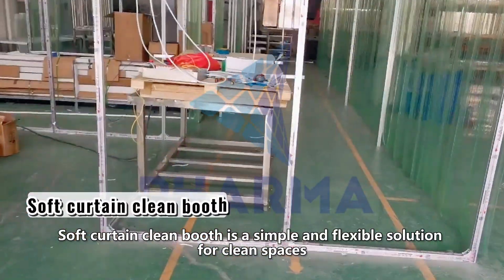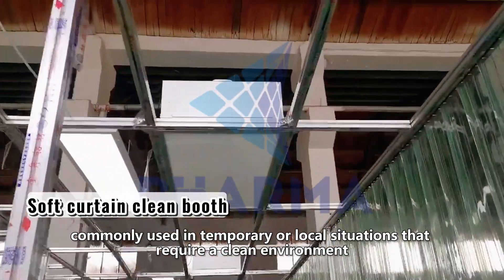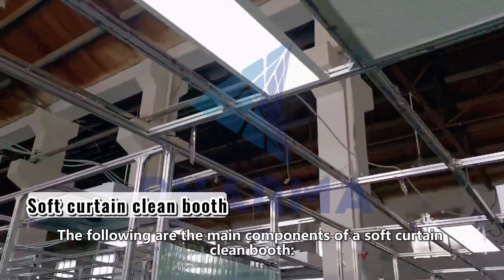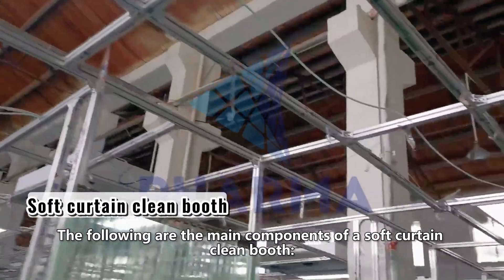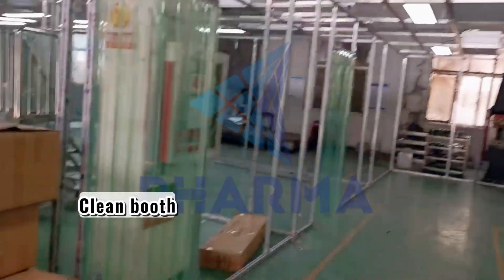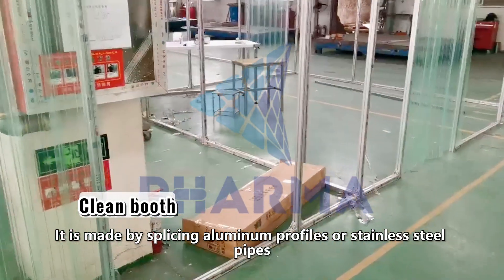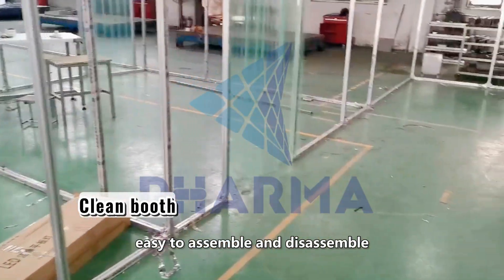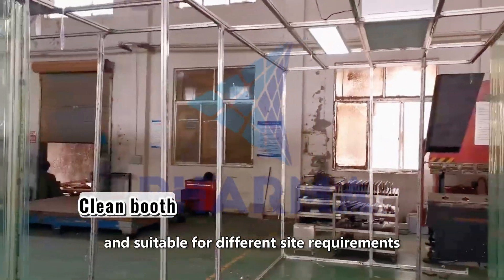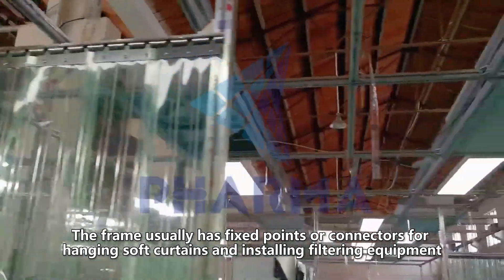A soft curtain clean booth is a simple and flexible solution for clean spaces, commonly used in temporary or local situations that require a clean environment. The first main component is the lightweight frame, made by splicing aluminum profiles or stainless steel pipes with a lightweight and stable structure, easy to assemble and disassemble, and suitable for different site requirements. The frame usually has fixed points or connectors for hanging soft curtains and installing filtering equipment.